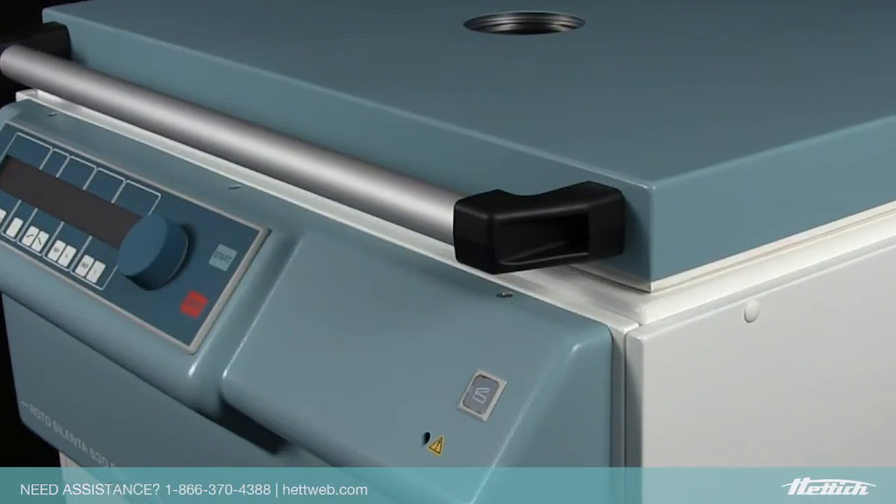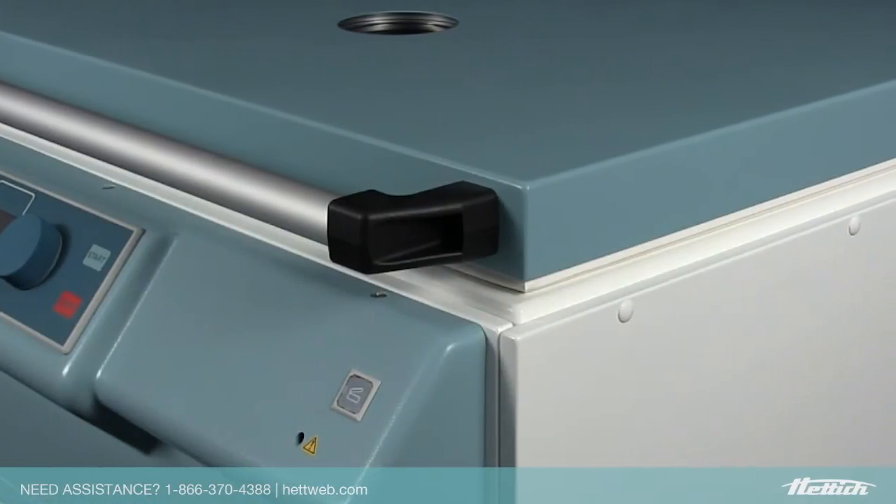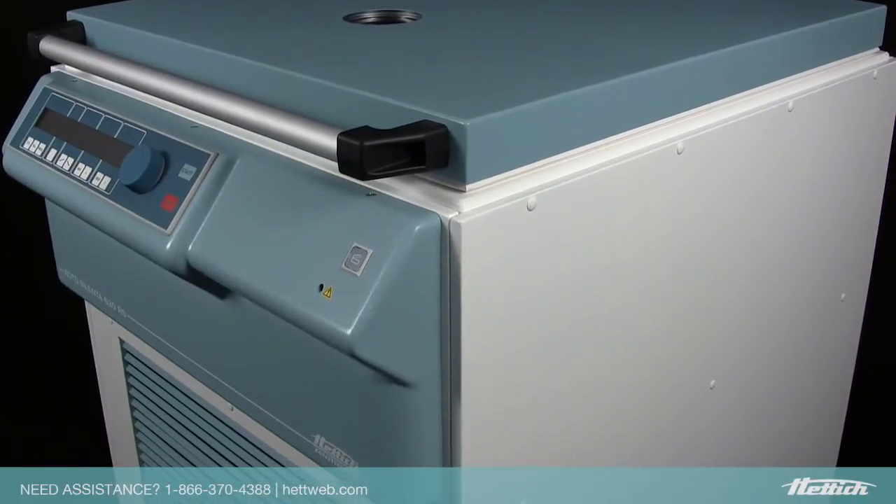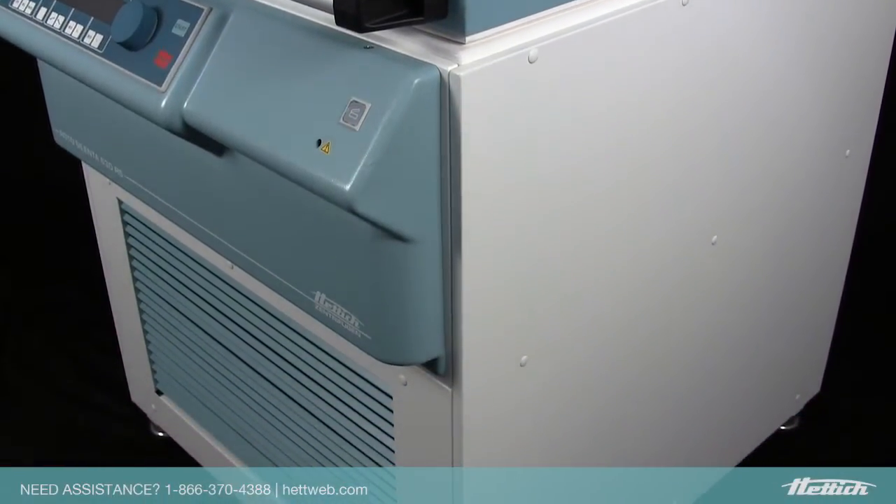The front-loading lid will also help eliminate the overall footprint of the unit versus traditional side-loading centrifuges. To put it in real terms, the Silenta is roughly the size of a standard washing machine.